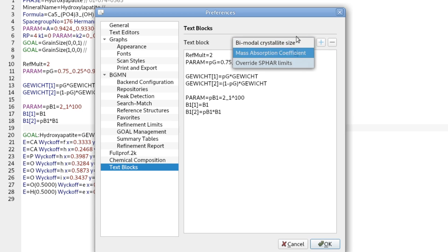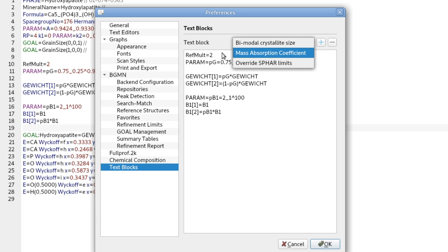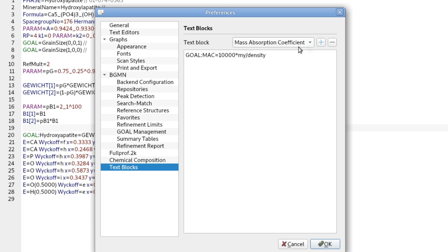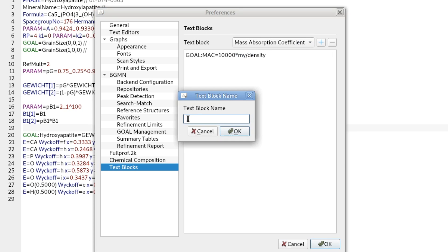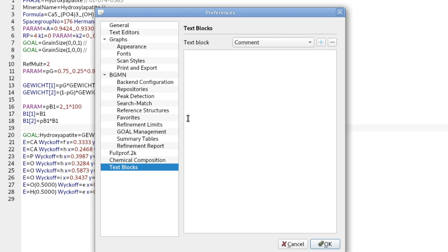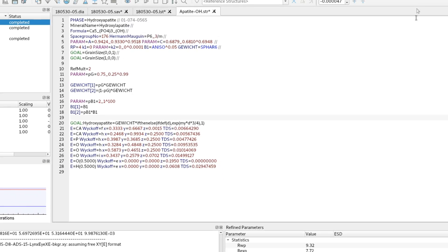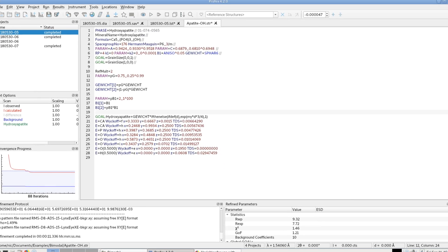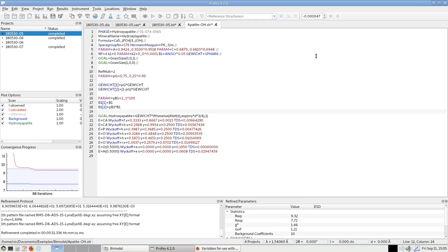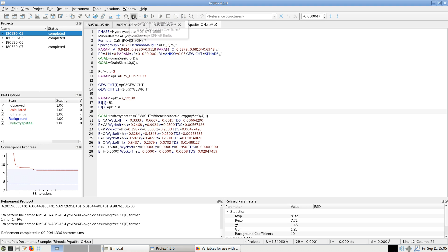So some of them are predefined and the one to calculate the mass absorption coefficient is one I created myself, so we can just create a new one and for example add just a comment we would like to add to our files. And then we have to restart Profex before they will show up here in the menu.